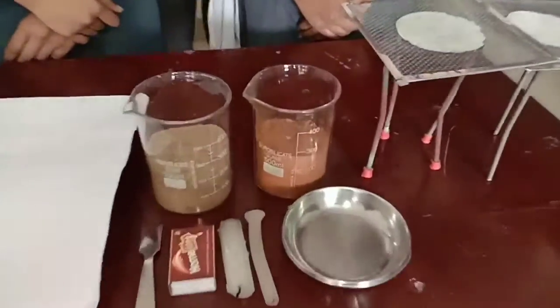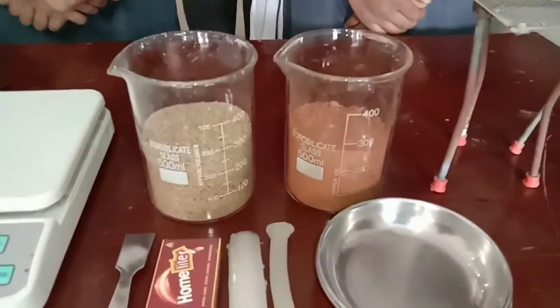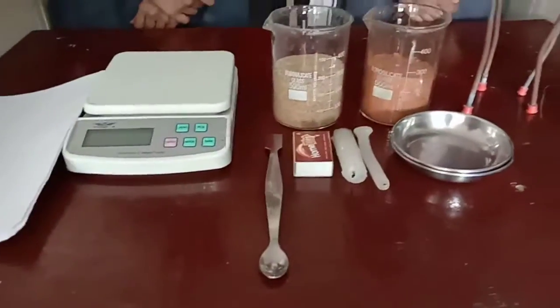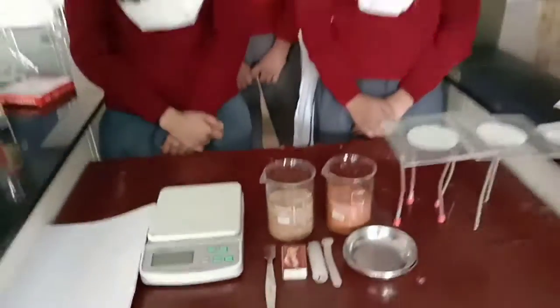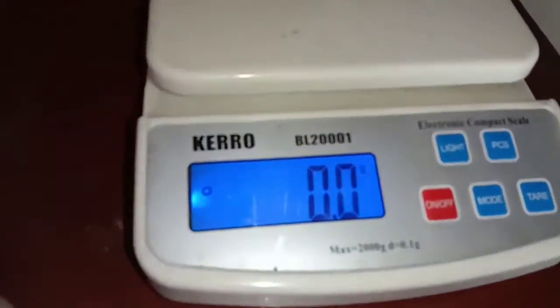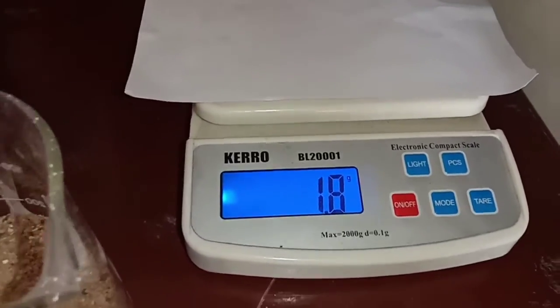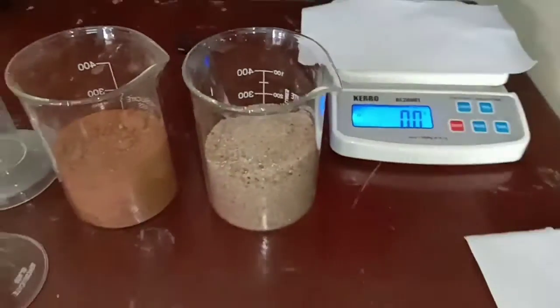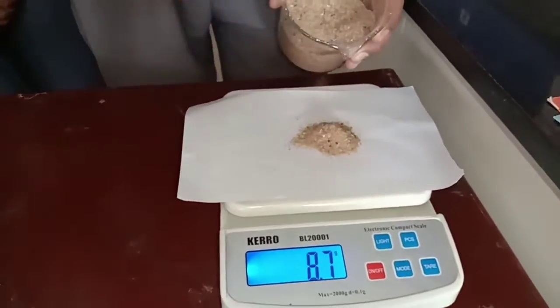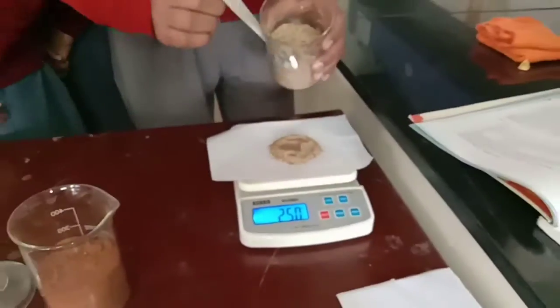Requirements for the experiment: soil sample, electronic balance, sheet of paper, tripod stand, wire gauze, burner or candle, matchstick, spatula and container. The procedure of the experiment: firstly, we will measure 25 grams of soil from each soil sample with the help of electronic balance.